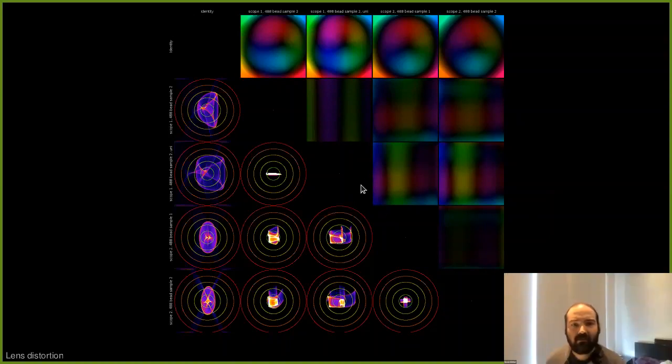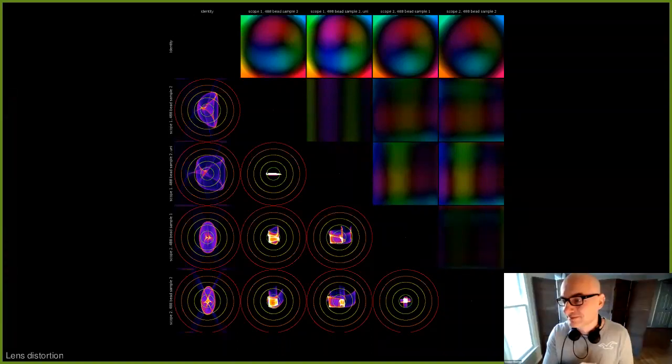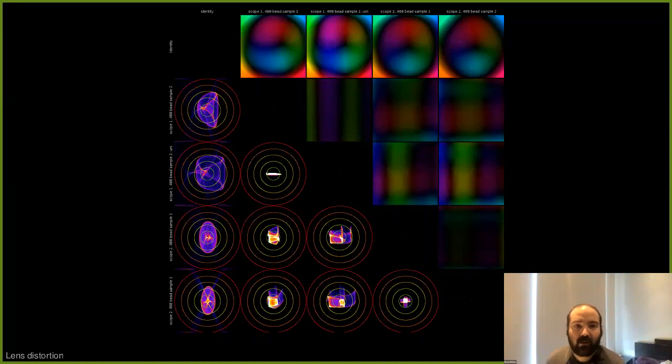Hey, Stephan. Yeah, go for it. It seems a bit weird. Could this be sort of an artifact from the tiling? So if you change the width, the overlap. Mm-hmm. One thing I would test is to change the overlap and see if those stripe positions change. So do like 80% overlap or 40% overlap and see if these things change with that. Because it might be like a strong edge artifact that introduces these things. Yeah.